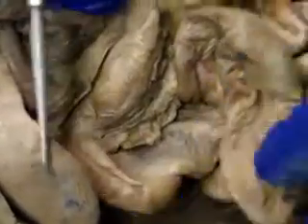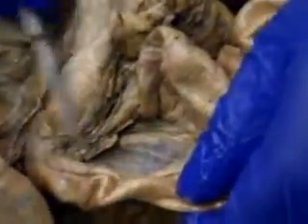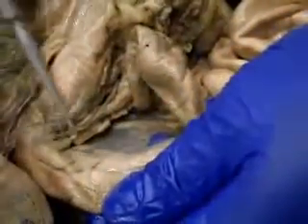Following off of the stomach here, we come into the small intestine, and most of this is small intestine here. So this beginning part of the small intestine is the duodenum. So that is the duodenum right there. And we're seeing another organ right next to the duodenum, right there. So we're seeing that organ right there, and that is the pancreas. So that is the pancreas. So if I put it somewhere in the middle here, I want jejunum. So that's the middle portion of the small intestine, the jejunum. There is a membrane that we see in this area, and that is called the mesentery. So that is the mesentery.